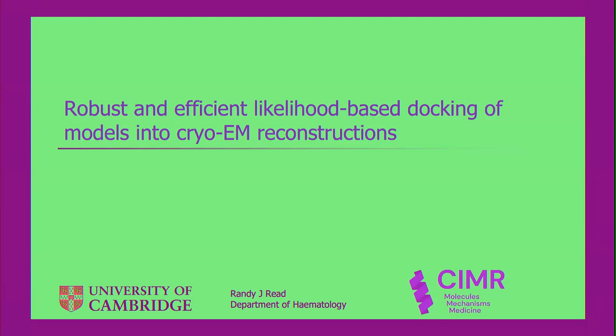Okay, great. So I've been attending these meetings for a few years, so it's a particular pleasure now to be here as one of the speakers, talk about some work we've been doing in the intervening time. So this is about docking atomic models into cryo-EM reconstructions.